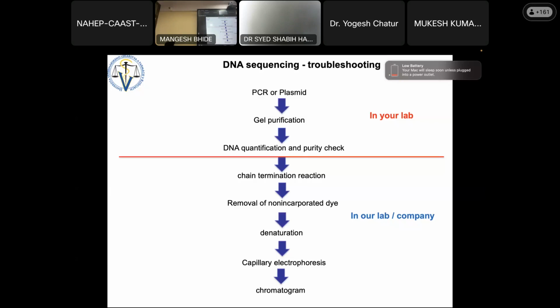For the sequencing, do we need to pool that from the multiplex? No, never pool, because each product is different. So you have to cut the band and treat it as one sample, another band, another sample. Otherwise, there is no sequencing.